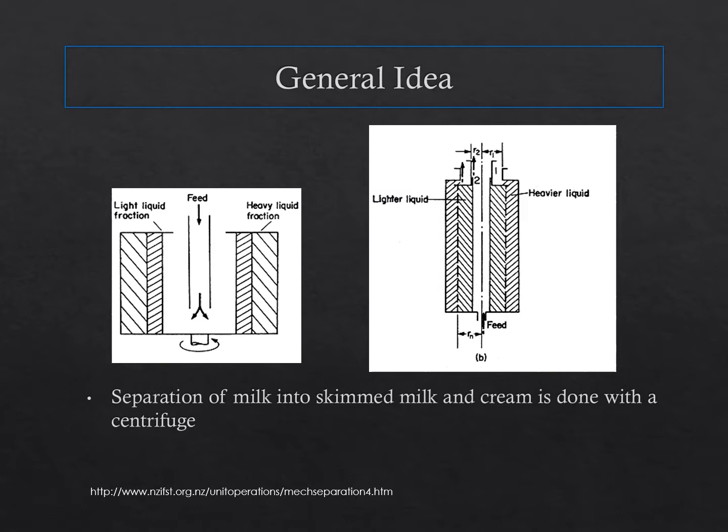The general idea of separation of milk into skimmed milk and cream is done with the centrifuge. Small pictorial representation of the centrifugation process.